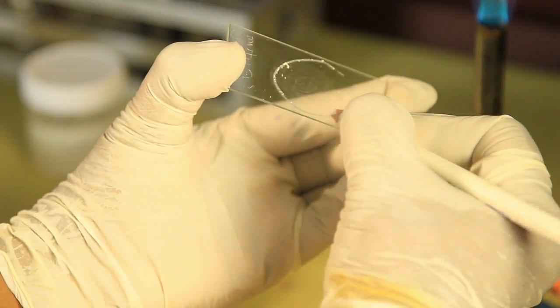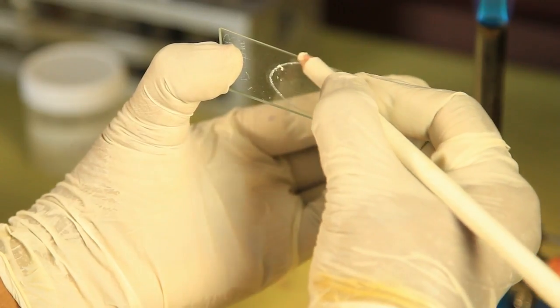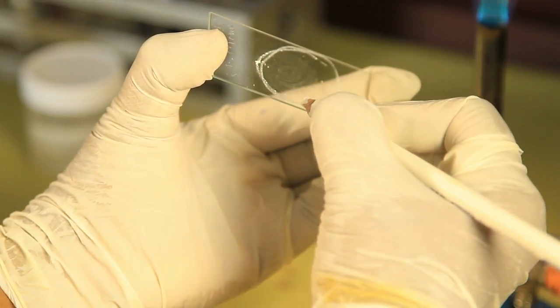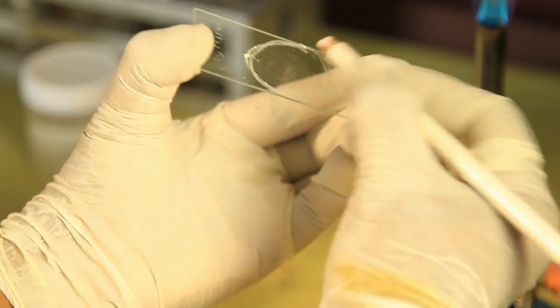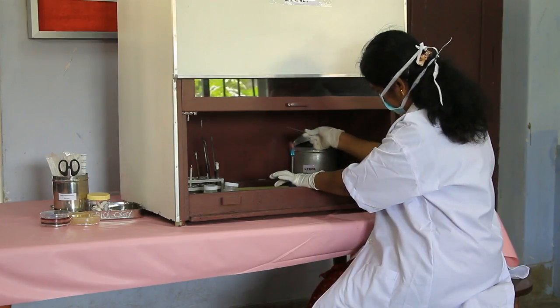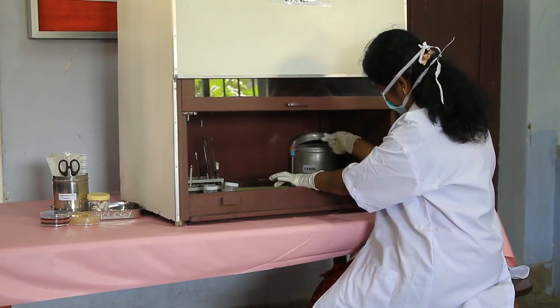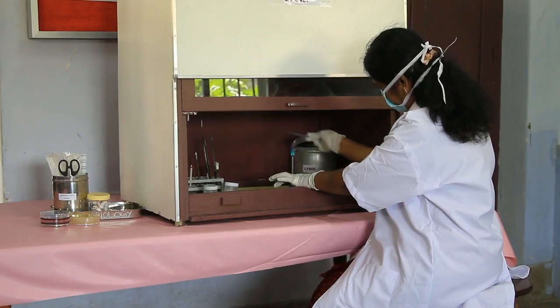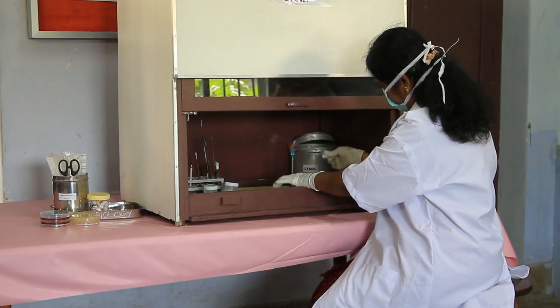Mark the position of the smear on the under surface of the slide with a glass marking pen or pencil. Heat fix the smear by passing over a flame for 2-3 seconds, taking care not to burn it.